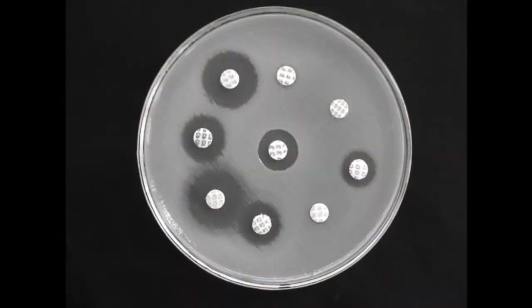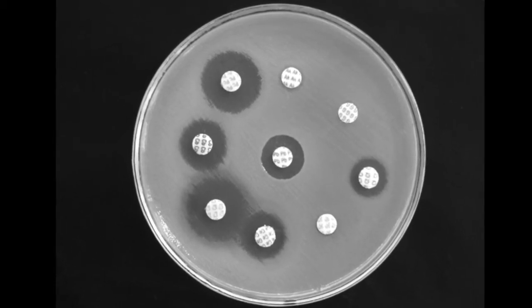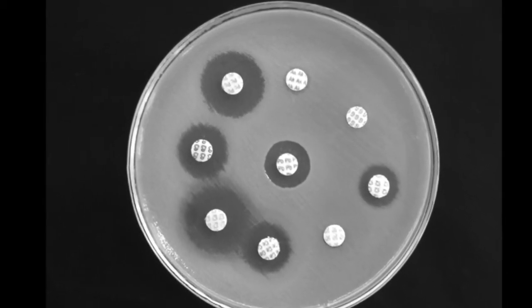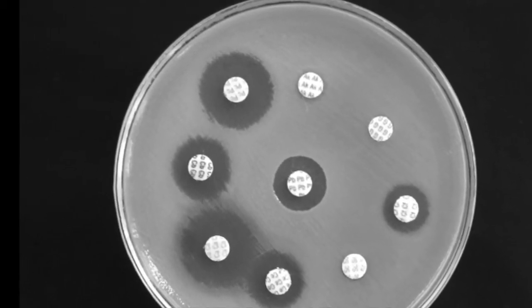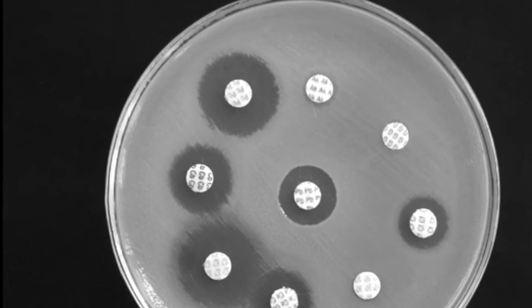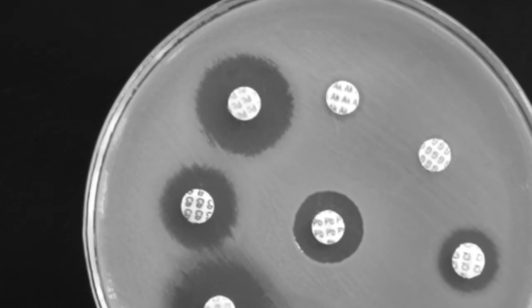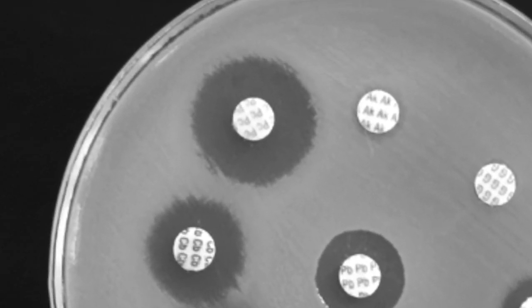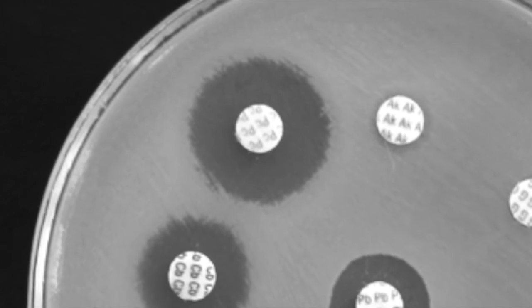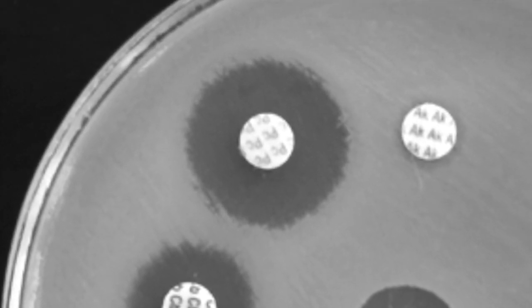They will plate the bacteria on a petri dish with multiple discs, each impregnated with a different antibiotic, and incubate it. There will then be zones in which the antibiotic killed the bacteria, called the zones of inhibition. So the larger the zone, the more effective the antibiotic. And a small or absent zone indicates non-susceptibility of a bacterium to an antibiotic, also known as antibiotic resistance. This technique standardizes data collection.